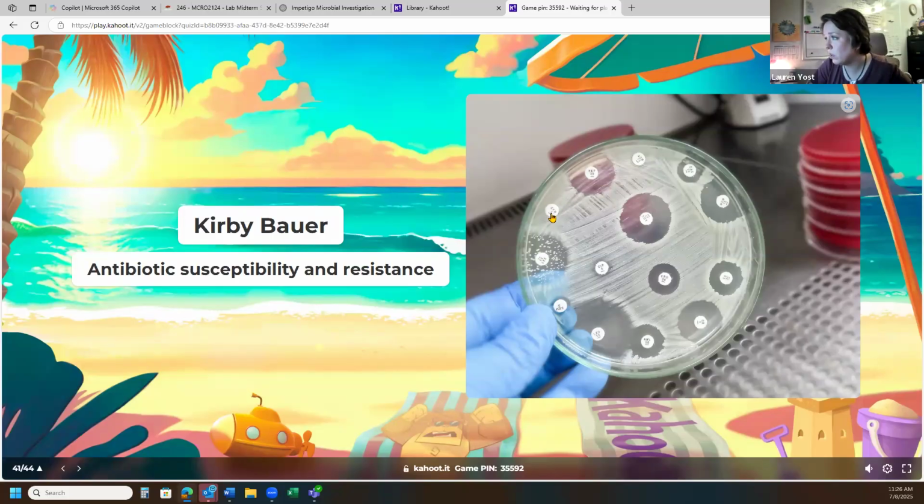I would say this one, whatever that is, and this one, which I think is azithromycin. I don't know what this one is. And then we have CIP, which is not a good choice. This is Cipro. This would not be a good choice for this bacteria. So we would go with whatever this LZO is. Right. So that's how you would look at that.